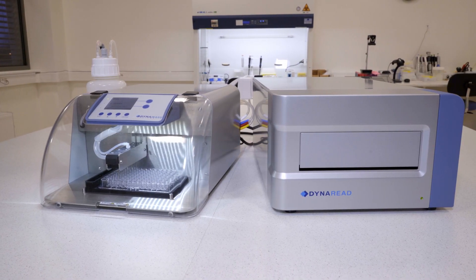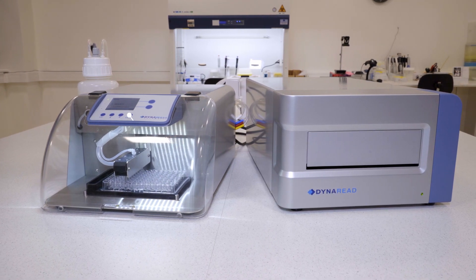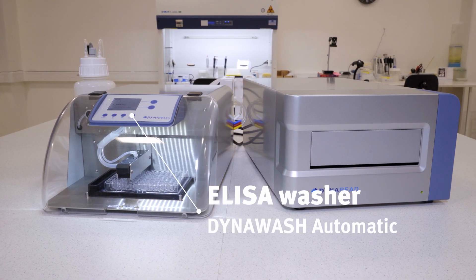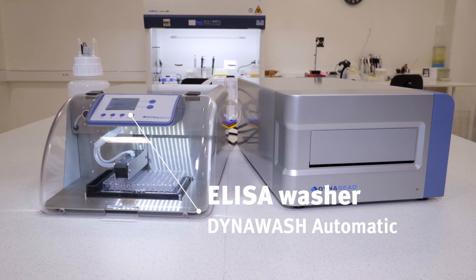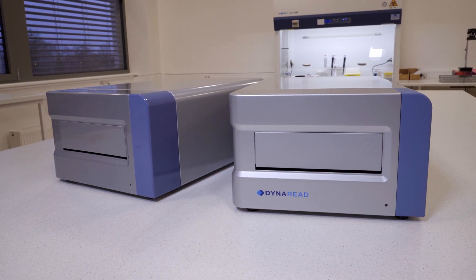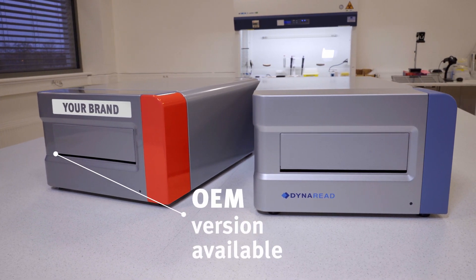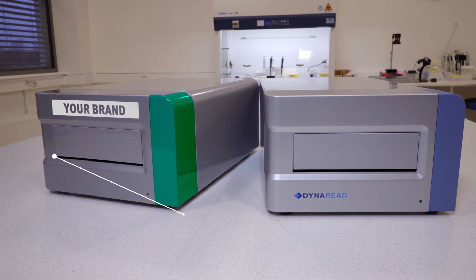Are you looking for a complete ELISA workflow? Check out our ELISA washer, DynaWash Automatic, which partners perfectly with DynaRead. We as a manufacturer and software developer can make both the reader and the washer as an OEM version, and also customize them for you.